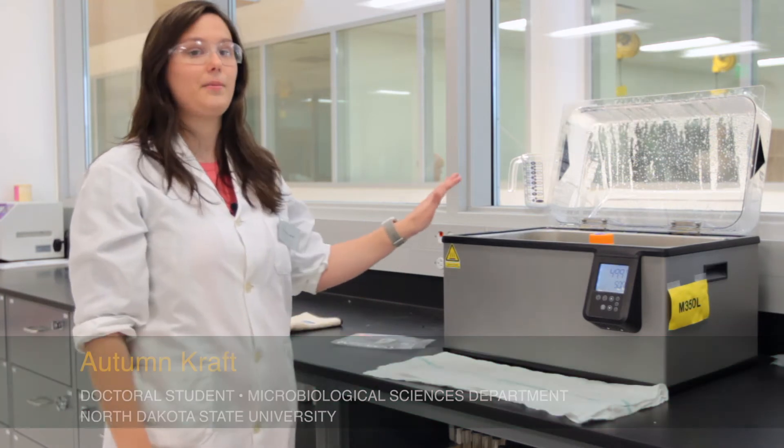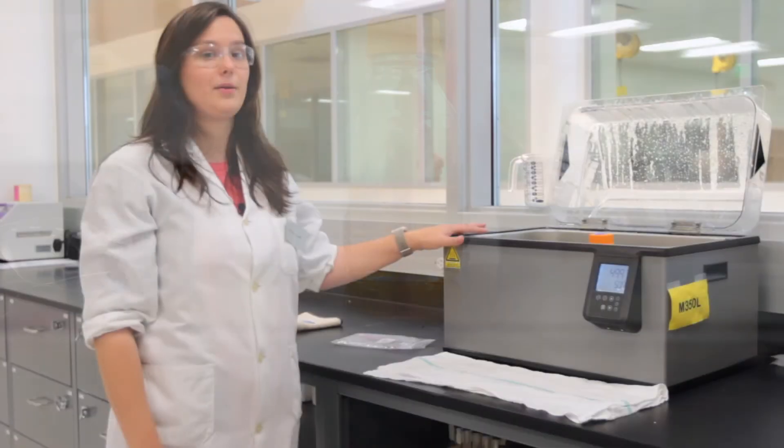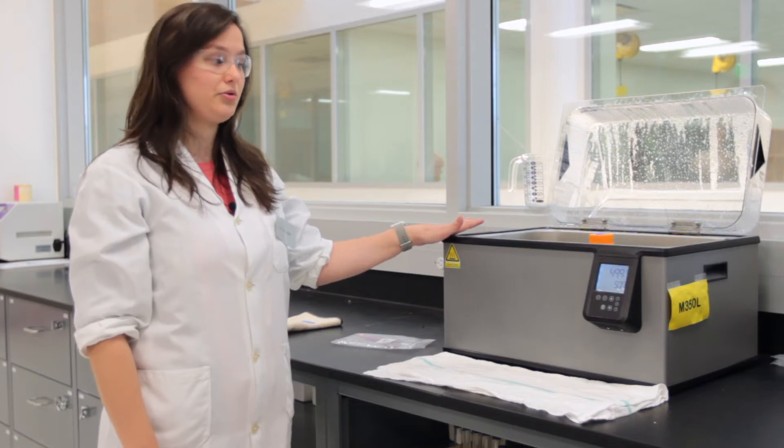Today we'll be doing pour plates with agar. When you're going to be pouring agar, you have to come to the water bath and retrieve the appropriate bottle of media. Water in the water bath sits at 50 degrees Celsius in order to temper the media so it can be used in pour plates.